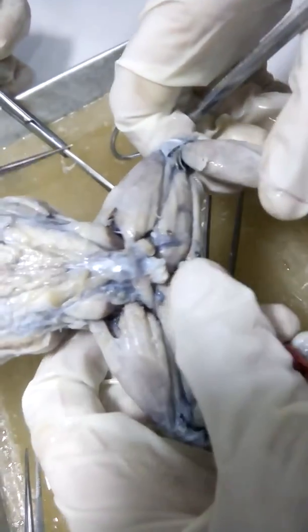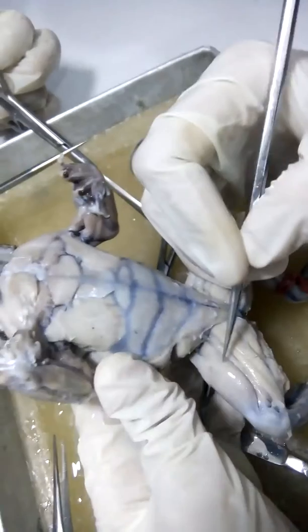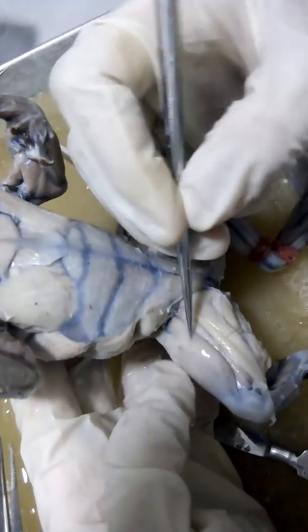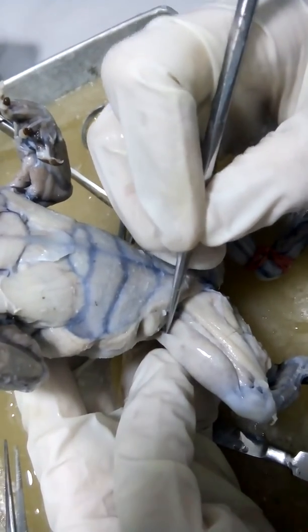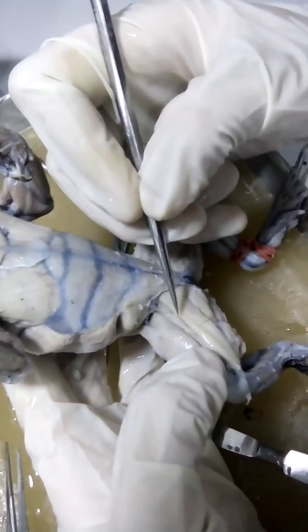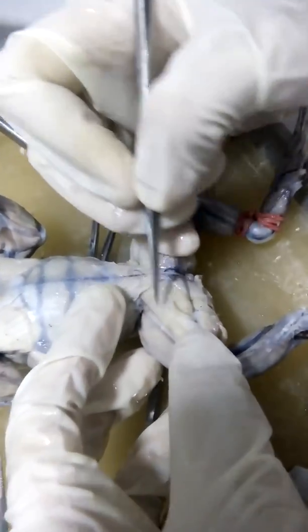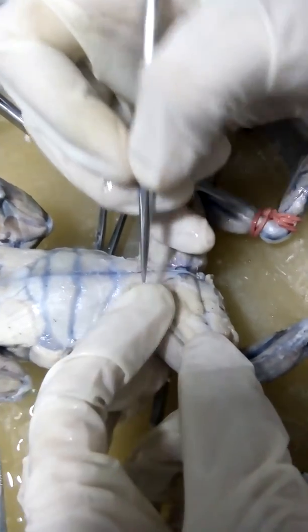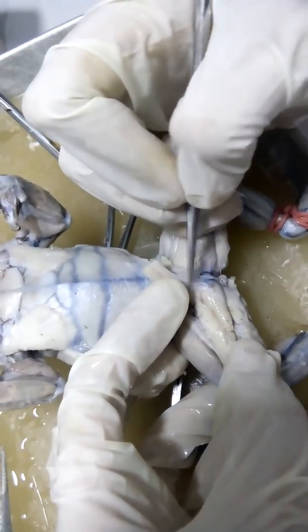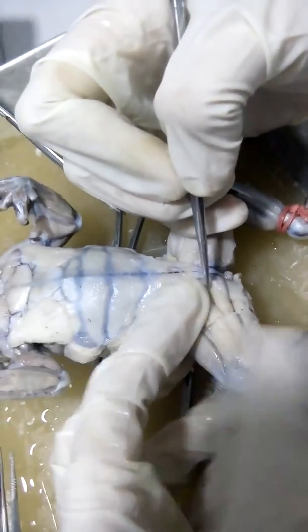And then proceeding to your ventral part, this right here we can see another head of your triceps femoris, your vastus internus. You can also see another head, your RFA, whatever that may mean. So this right here is your sartorius, covering parts of your adductor magnus and adductor longus.